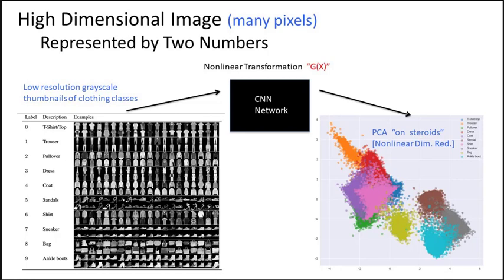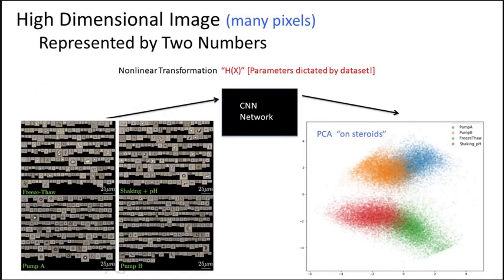And so it's an image compression scheme. The same idea can be applied to the data sets that we showed before with the monoclonal and polyclonal antibodies with different stress histories. Shown here are the IVIG, and shown here are the monoclonal antibodies, 2 different stresses. They form these 2 different islands. Within these islands, they have some overlap between the monoclonal and the polyclonal, but they're pretty well separated with a 2-dimensional number.